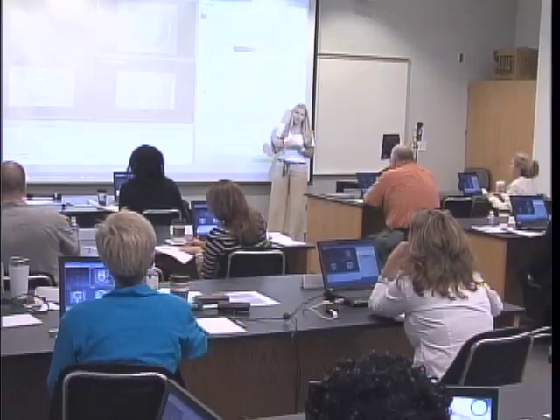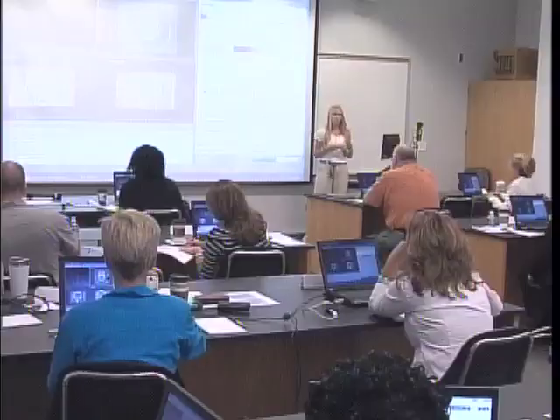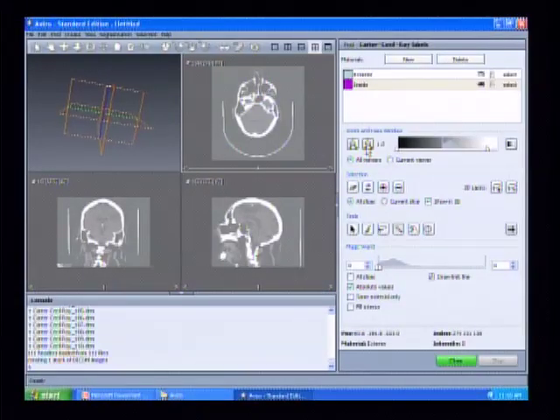You will notice that you have this all slices and then this current slice and then a checkbox that says show in 3D. And this is, I guess, the most tricky thing about this Avizo program: the 3D button and the all slices option can save you a lot of time, but it can also set you back greatly. When we are spending hours doing some of these segmentations for ones that are very difficult, you can use the 3D button to select several materials at once, and I'll show this in a second. But you can also accidentally select them and delete them. And there's currently no undo button that we're aware of.